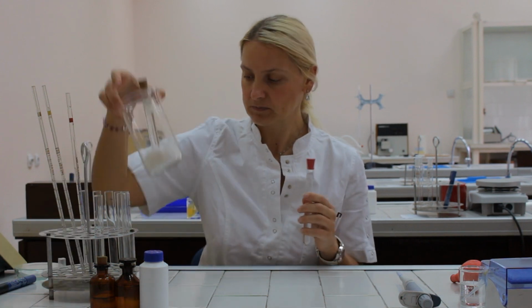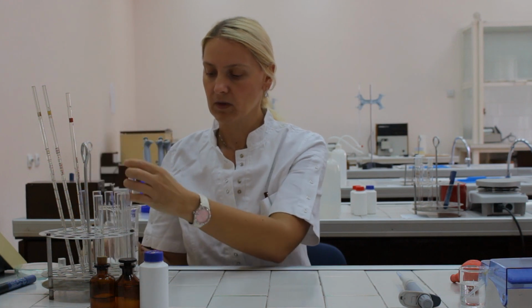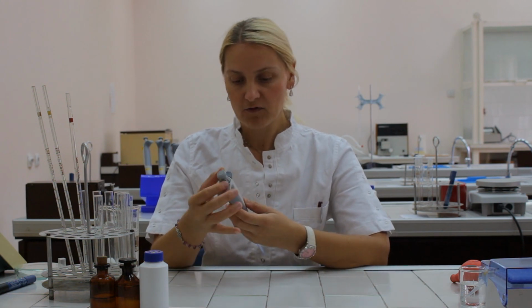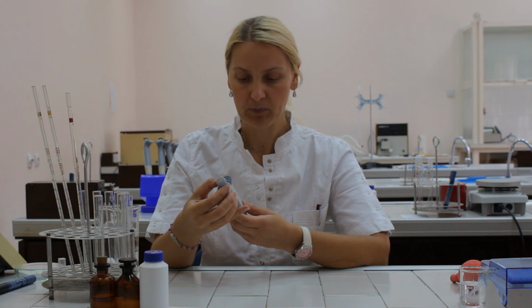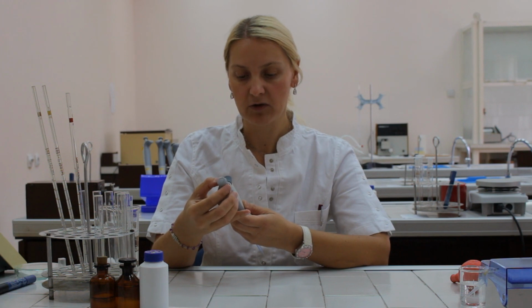Now we have to prepare 5 standard solutions by making certain dilutions of the initial solution of inorganic phosphate. For example, we're going to pipette different volumes of inorganic phosphate solution. First, we're going to pipette 100 microliters to the test tube number 1. And we shall do that by using the micropipette.